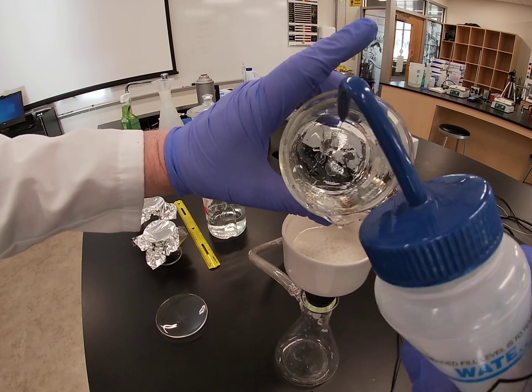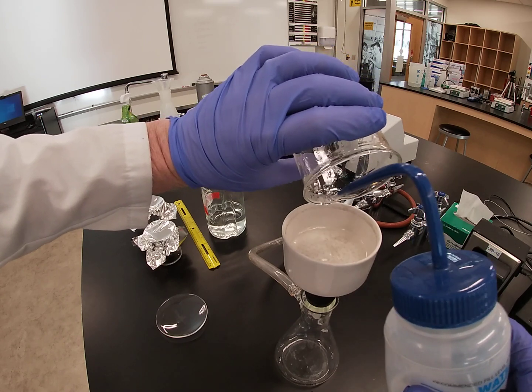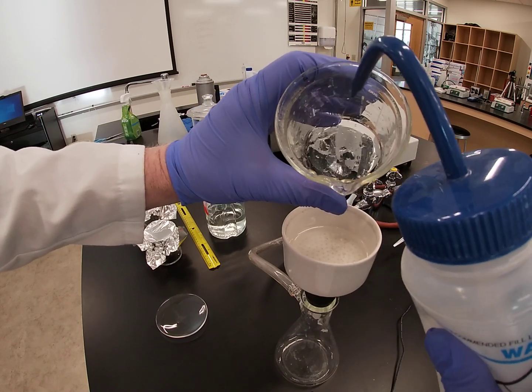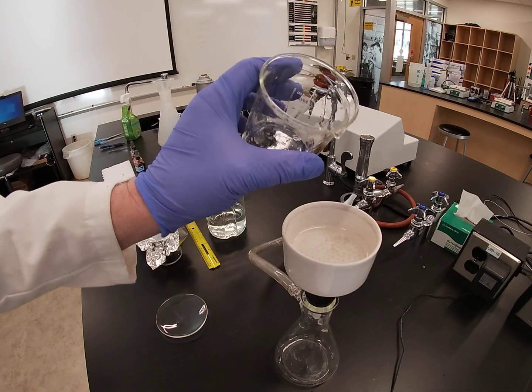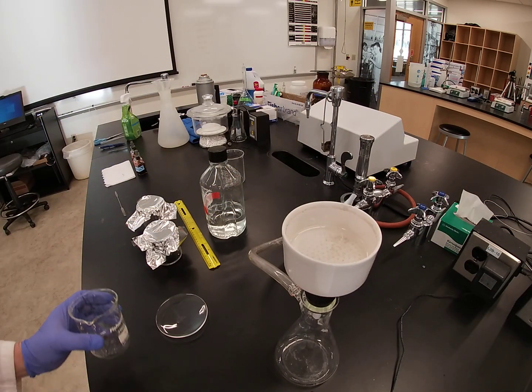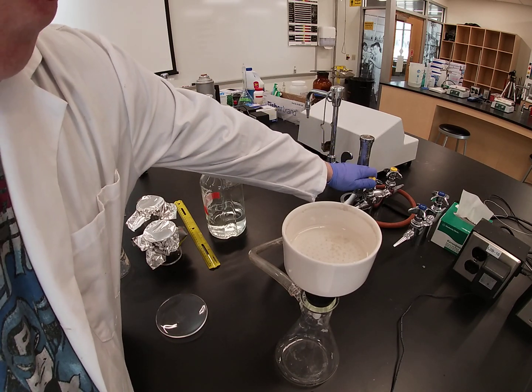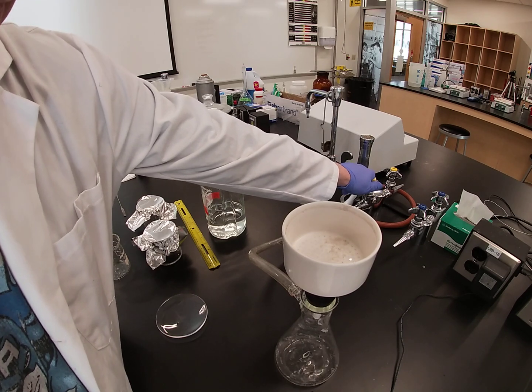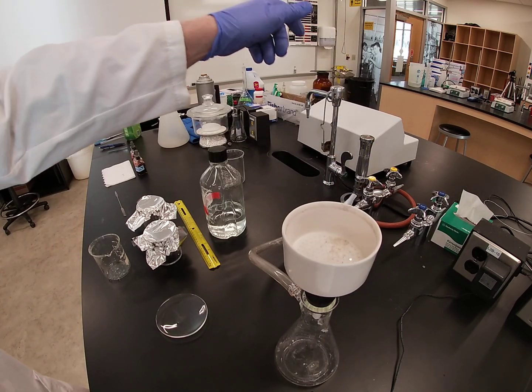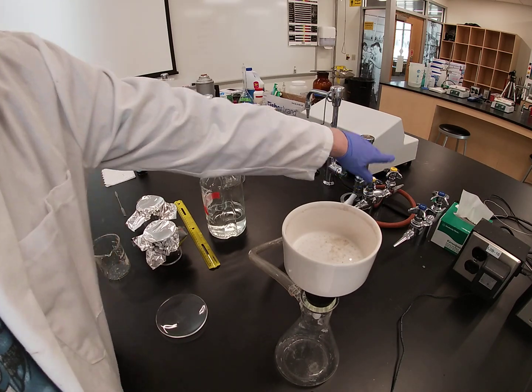So as we're going along, you probably should have recorded some errors. These are called random errors, like spilling the naphthalene, not getting everything out of the beaker when we filter it. So when I turn on the filtration device, it takes it right out of there.